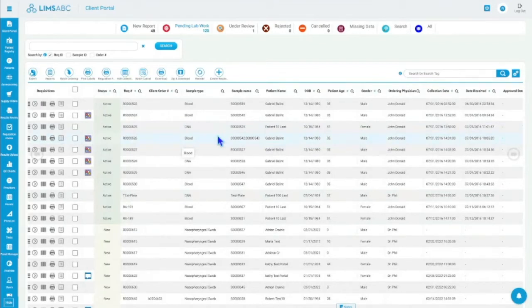But we have a portal status that we can update with other information that is just for your clients to see, if you need to update that value at any point to give them more information. We can swap them, right? So instead of having the status, we can have that portal status where it gives them more information. But it's the same for everybody, all the users of the system.